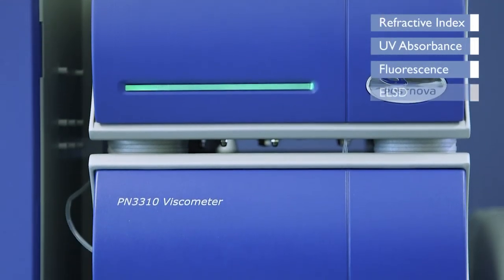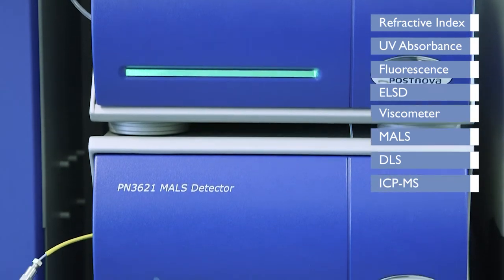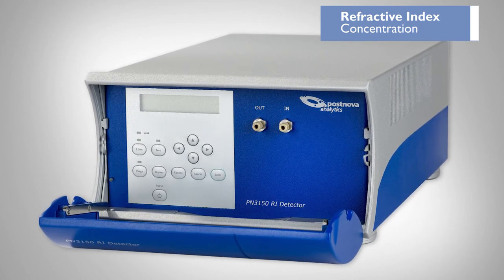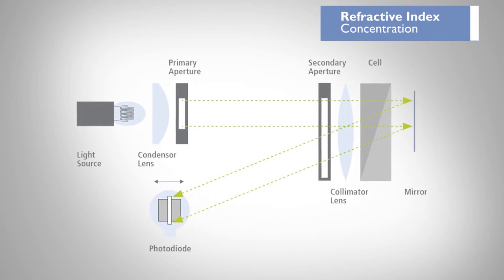The detection options on the Postnova platform are extensive and allow full characterization of the separated species. The Postnova RI detector is a high-sensitivity concentration detector, which is ideal for polymer and protein applications.